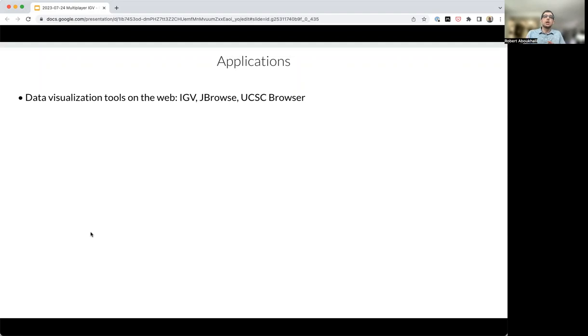And so when you use this sort of application with video conferencing and screen sharing, you can not only support the synchronous mode of collaboration, but also the asynchronous. If you're in different time zones, you can collaborate on it and work together. The other kind of application that I've not yet explored is data analysis web tools. Platforms that let you analyze your bioinformatics data typically don't have very many collaboration tools, and it would be nice to see how this can be applicable there.